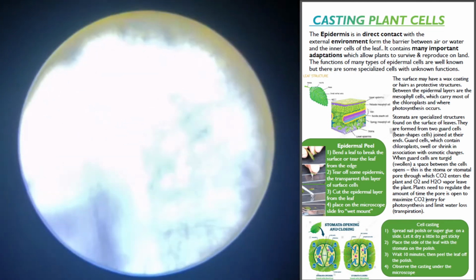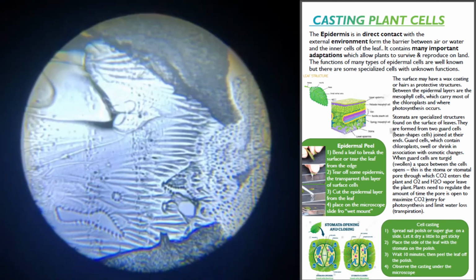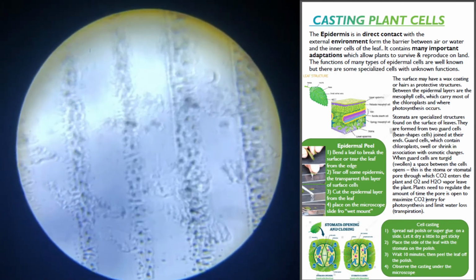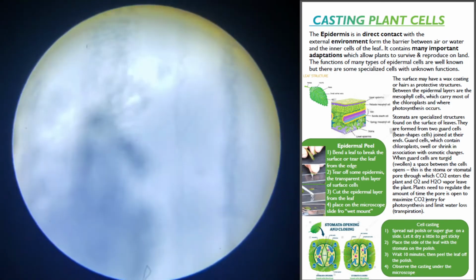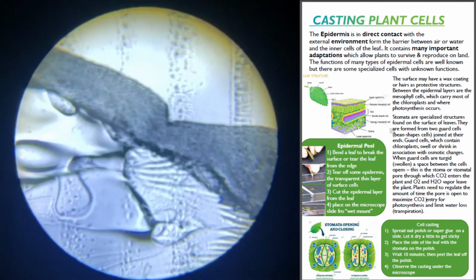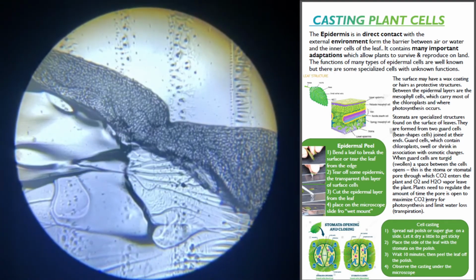What we're looking for. Here we go. There we are. So these are the peel lines. When you peel the tape off, it leaves those lines, but there is the leaf. Right in there. Wow. There we go.